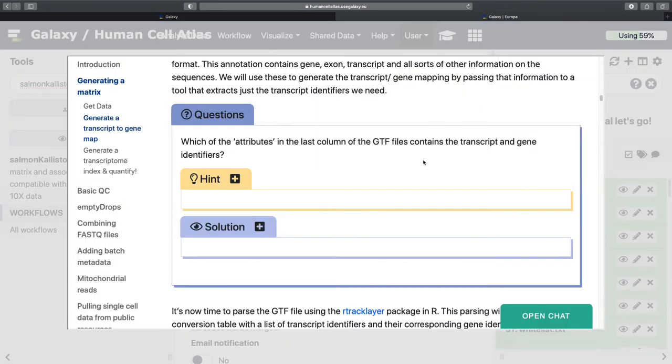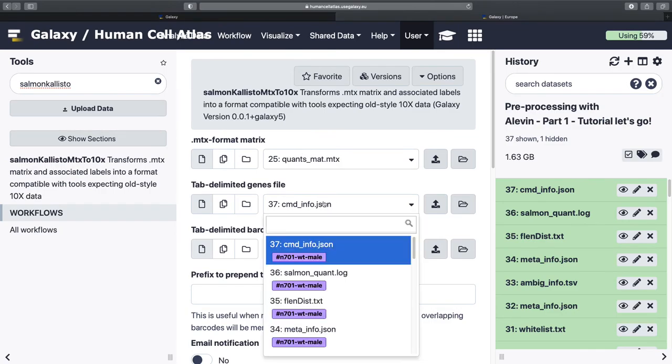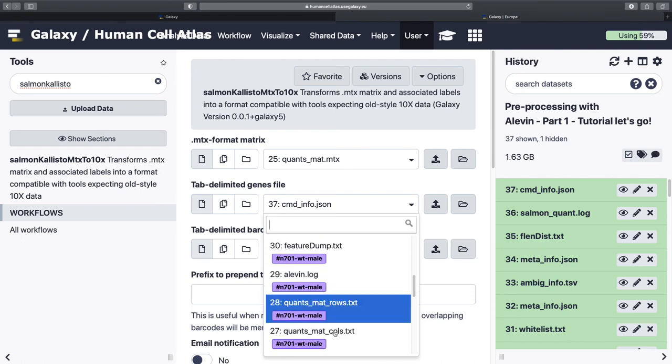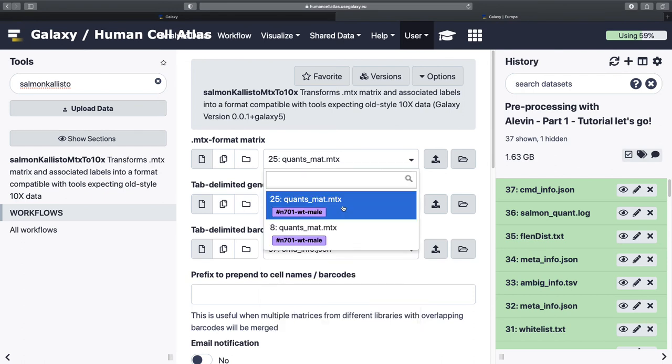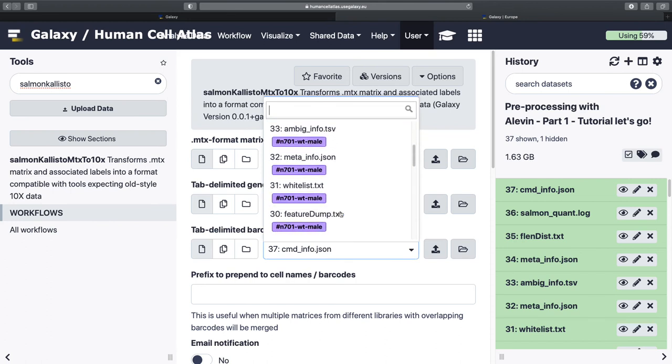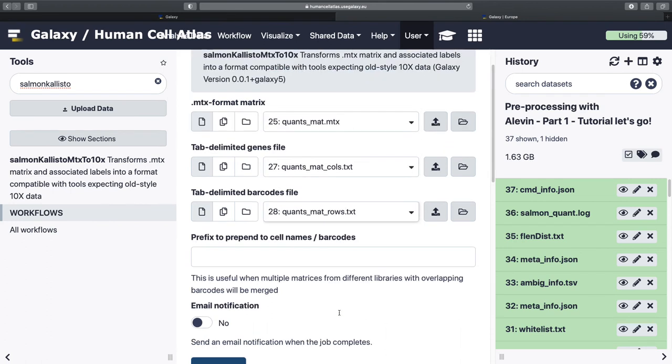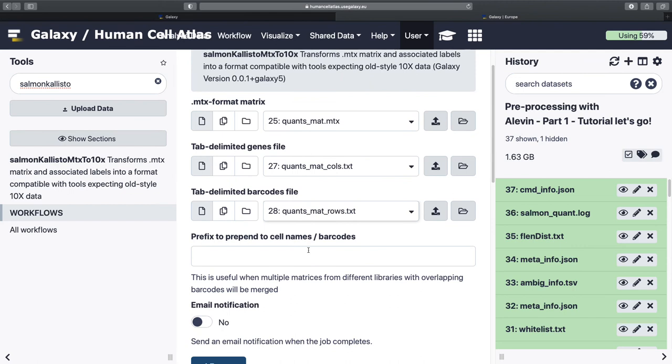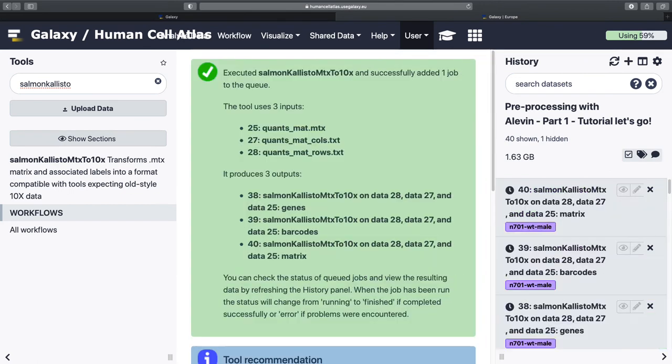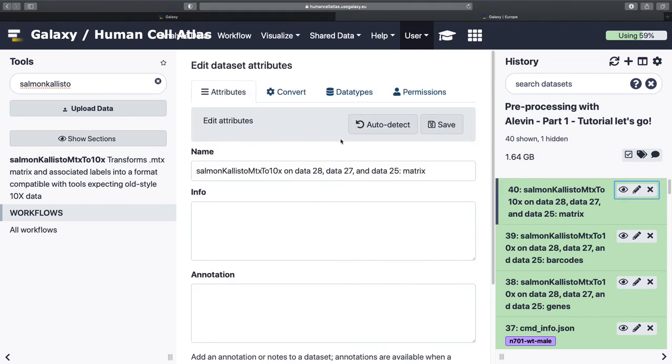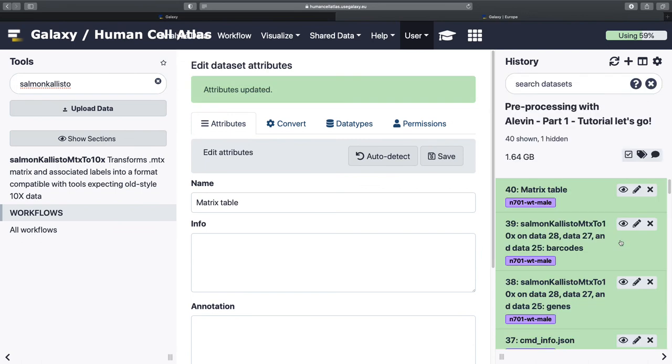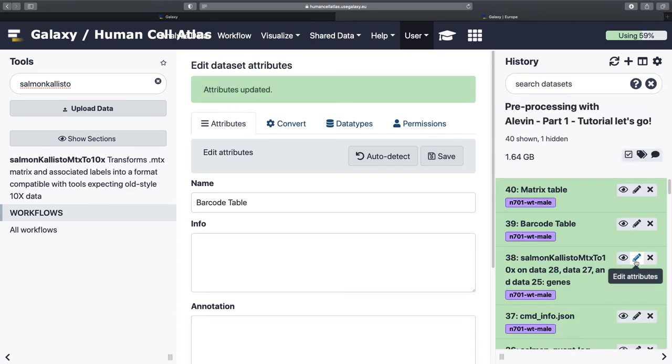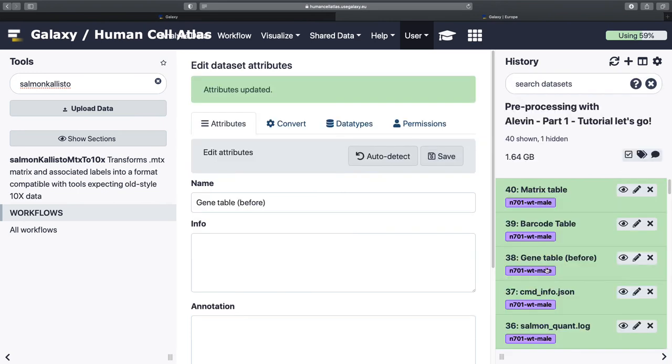And again, you can use the tutorial version in order to find these tools. So you can see the two versions there. And I'm getting all the later things. So that's good. And we're going to rename everything. So this is going to be what matrix table. Sure. Just cause everything else I named a table. And so we're stuck with that now. Lovely stuff.